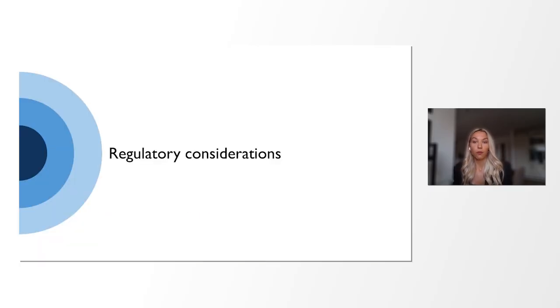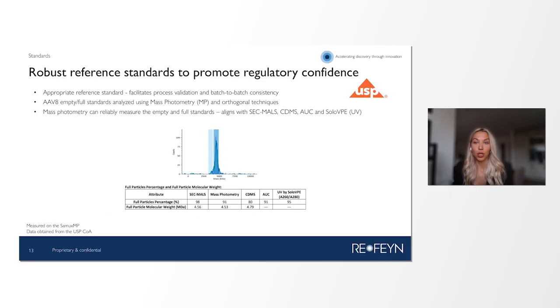Gene therapy for a long time lacked good reference controls. This is really important because it could potentially lead to inconsistent assays. Establishing the assays and then running them could lead to not having consistent controls across manufacturing, and potential batch failures because of the inconsistent controls.